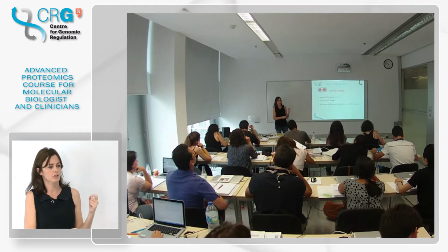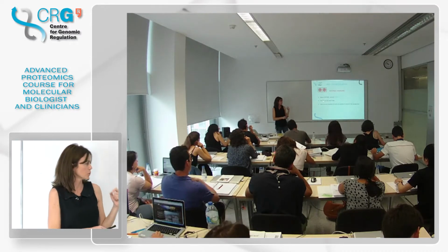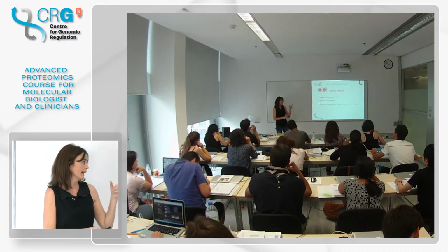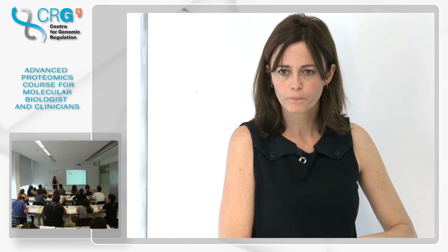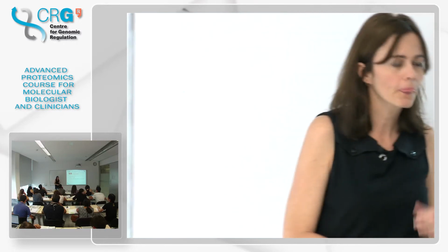One good idea is always to include quality controls in each one of your steps, and add the internal standard as early as possible to account for this sample loss. Okay? Stability of the standard is more important if it's absolute quantification. Yes, exactly. If you are doing relative quantification, you are just comparing samples. But if you want to know the concentration of the protein in your sample, then you need to go much slower. And the QCs, you do them with the proteins.